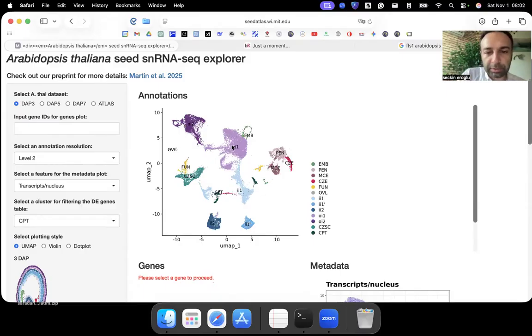So here, for example, there is a group. Here there's a grouping. Here there's a grouping. And you can immediately say the grouping here is quite different. This one is much more different than the rest compared to, for example, this one, because here the gene expression is not extremely specific, since there are many other groups around, or this one. But for example, this one is really far away from the others. So you can deduce things like that.